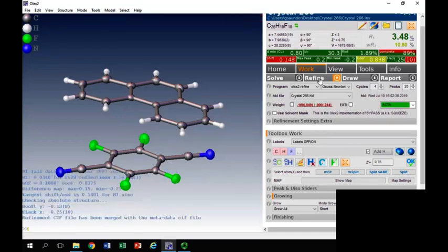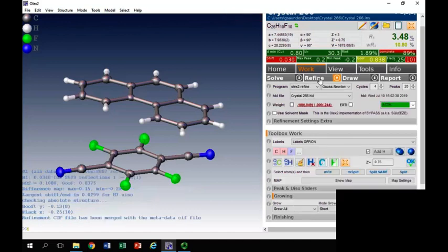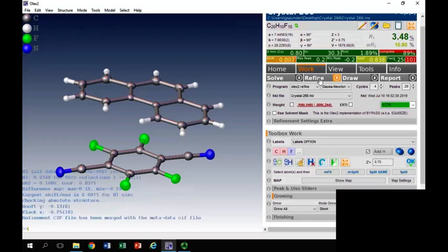You can see the shift has gone down, it's no longer red. We'll do it again. It's gone down. We'll do it again, it goes through 4 cycles again. And it's getting towards it. You need it to be 0. You need green.